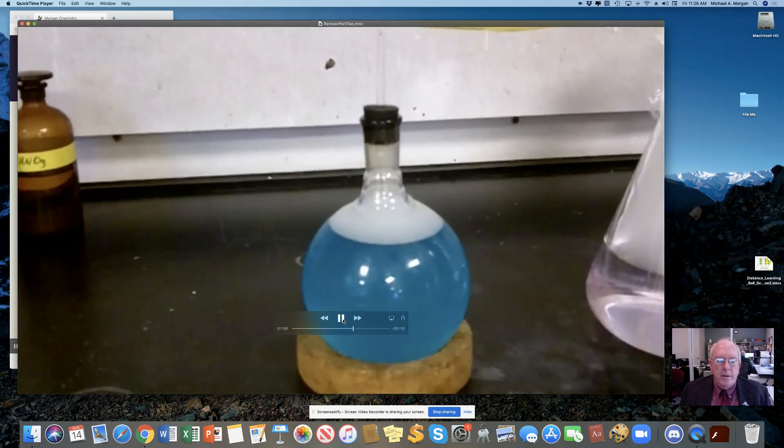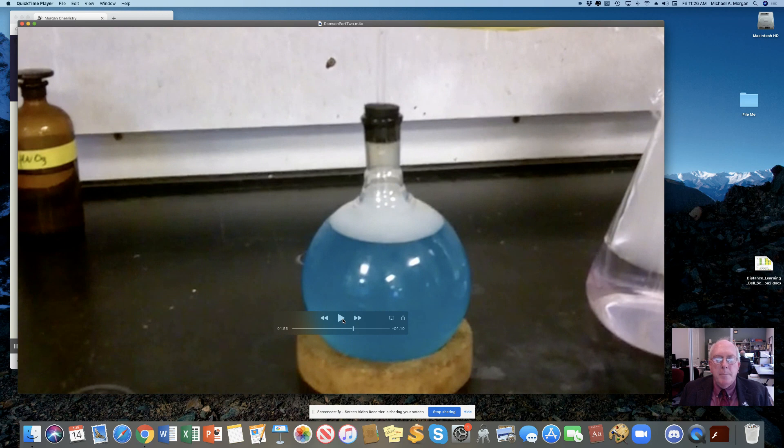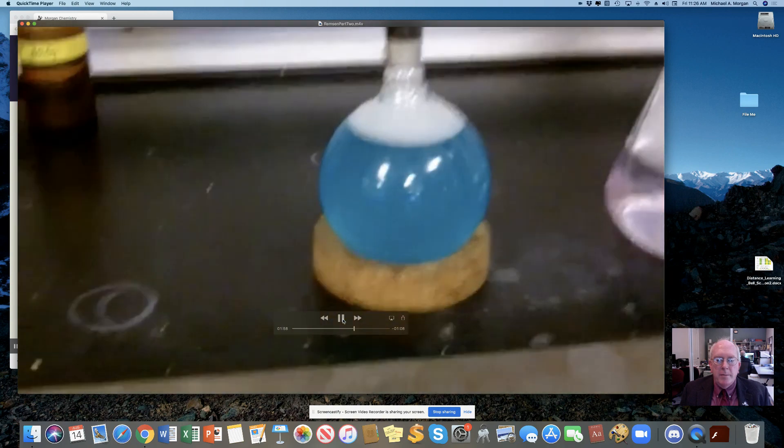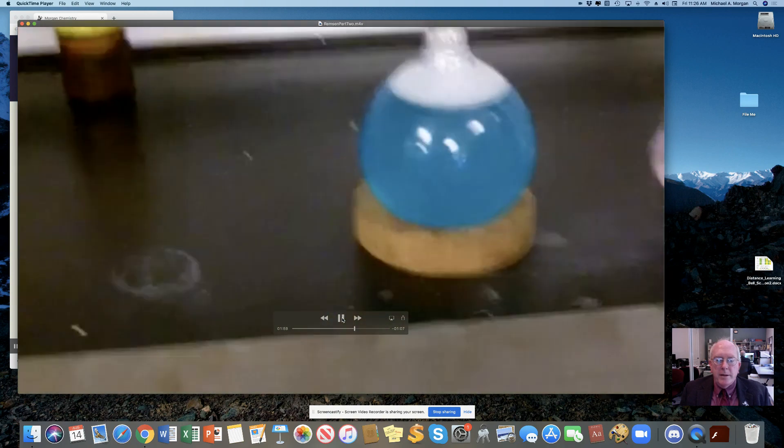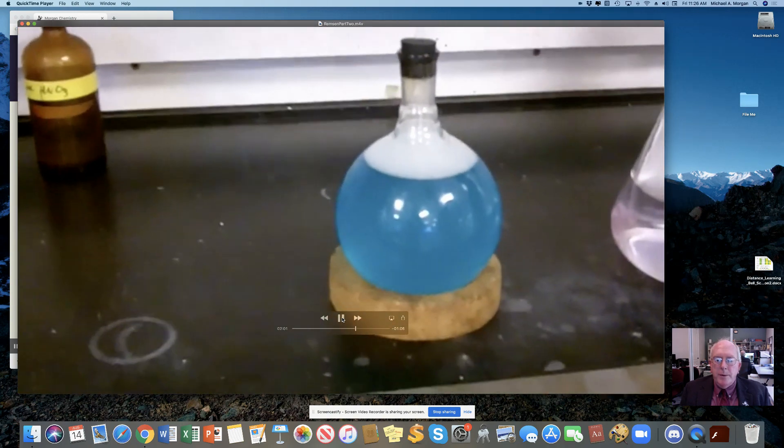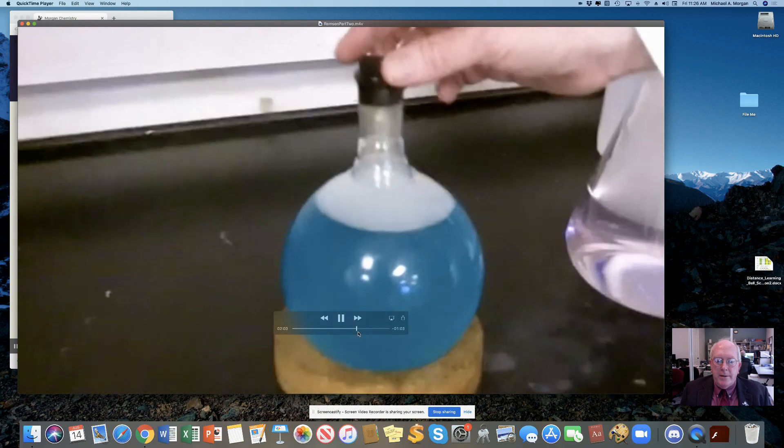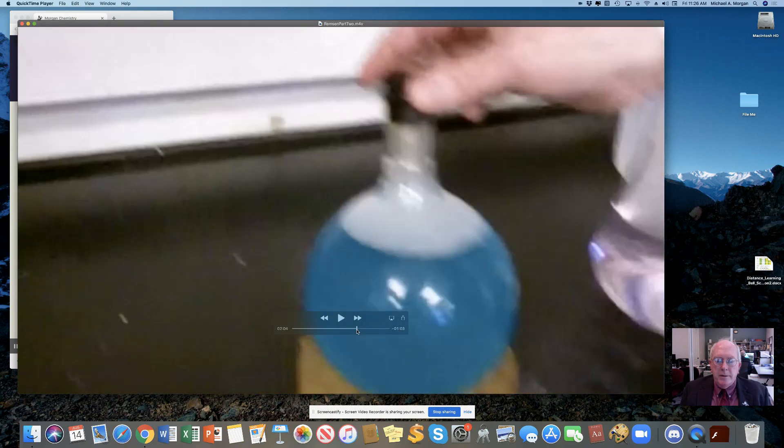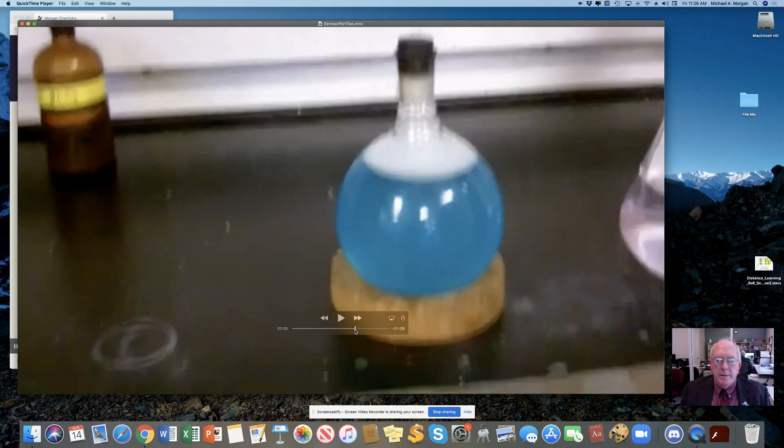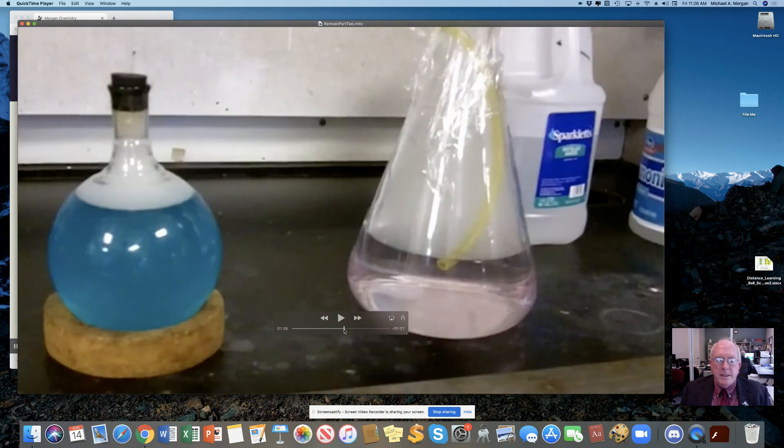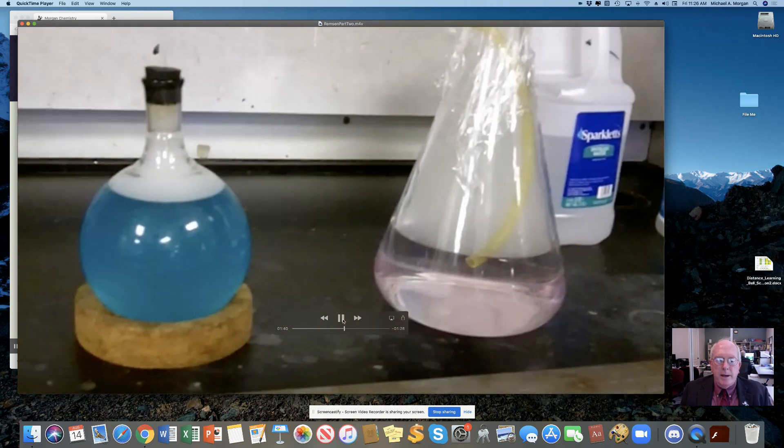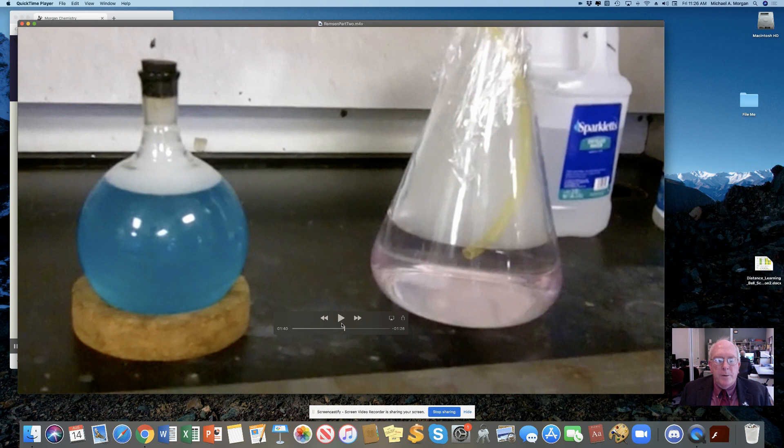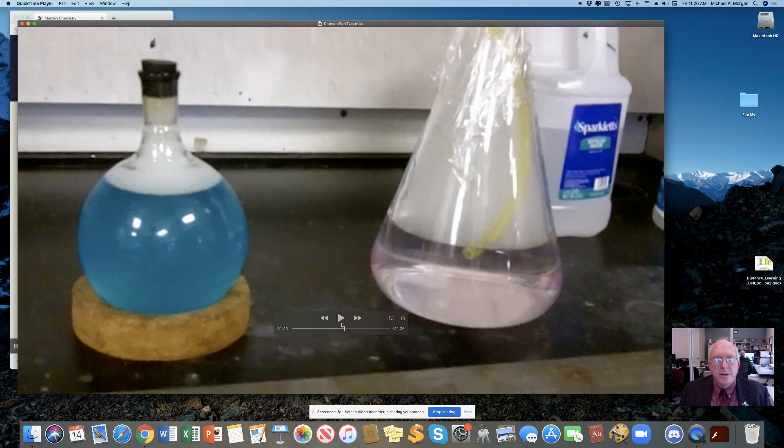Now, I'm going to pause that because it basically will just sit looking like that for the rest of the time. Let's see if we actually can get a view of both of the flasks together. I'm going to back it up just a little bit so that you can hopefully see, right about there. We'll pause and leave it there. So, that'll be pretty good for you to make your diagrams. And this page that we draw out on the first day of class, it's never turned in. It just turns out to be something that I make references back to for the rest of the year.